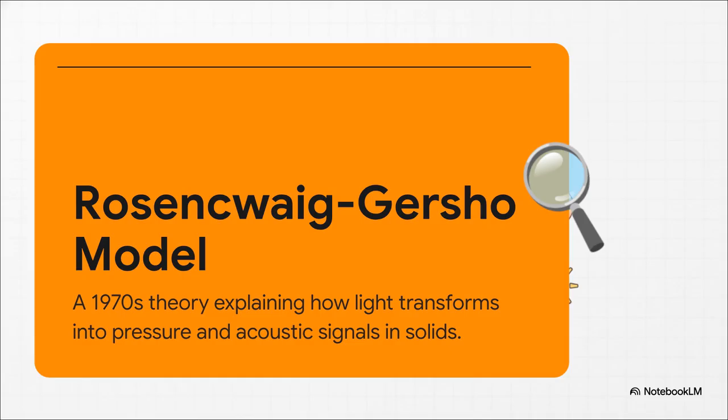Now, even though Bell discovered this back in the 1880s, scientists were kind of stuck. They couldn't actually extract meaningful chemical data from it for nearly a century. It just didn't make mathematical sense yet. But then, in the 1970s, Alan Rosencwaig and A. Gersho introduced their groundbreaking model. This framework finally provided the precise thermodynamic wave equations we needed to quantitatively interpret these incredibly tiny pressure fluctuations. It was an absolute game-changer that launched photoacoustic spectroscopy into the analytical powerhouse we know today.